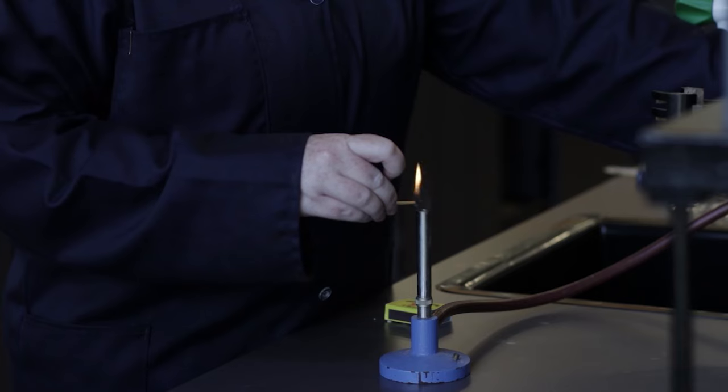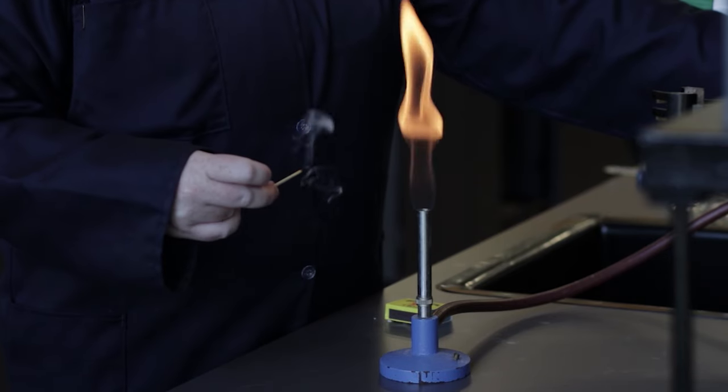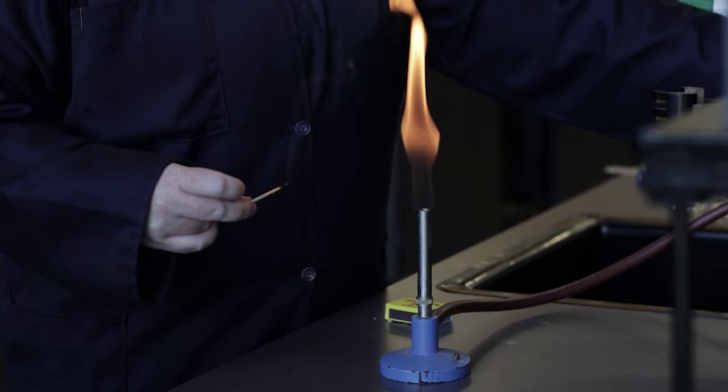Step 2: Once the Bunsen burner is lit, focus on blowing out the match before proceeding to the next step.